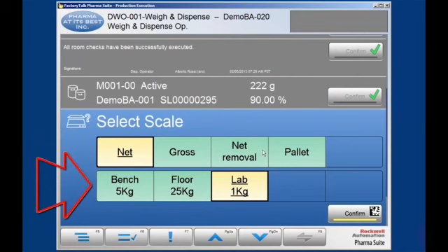The bottom half of the phase block displays the list of scales that were configured for the work center to which we are connected. This scale in yellow was also pre-selected by the system. The others in green are available but have not been selected. Keeping the system presets, we confirm by scanning the barcode located on the scale.